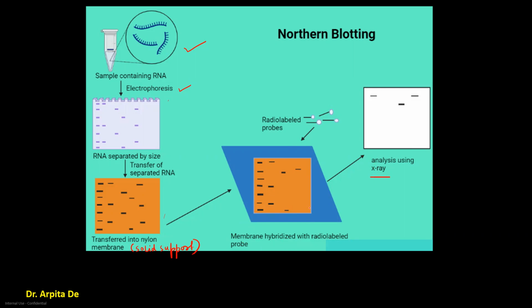So when you are writing a critical note on northern blotting, in the introductory part, you will have to write its definition, the principle, that brief little procedure, and one diagram which supports what you write.